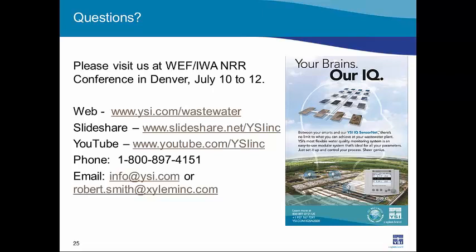Okay, I think we have time for maybe one more question. What is the typical cost of the YSI optical probe, and what would be the life of the probe? Yes, I was wondering how long it was going to take you to ask me that. The optical nitrate probe depends on which one you order. The most fully functioned nitrate probe, with the COD BOD measurement and nitrite measurement, would be close to $20,000.